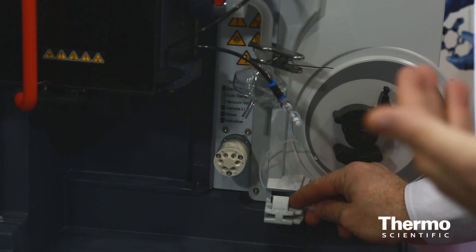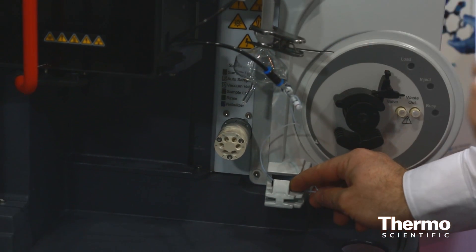We're hearing great things from our customers about the ICAP 7000. One of the features they really love is the drain sensor. The drain sensor monitors waste coming out of the spray chamber. If something goes wrong at the front end, it will react to that and shut the instrument off so you're not going to waste sample.